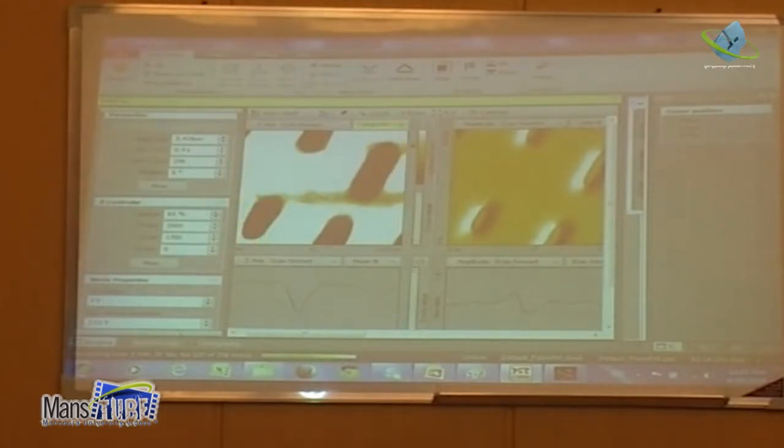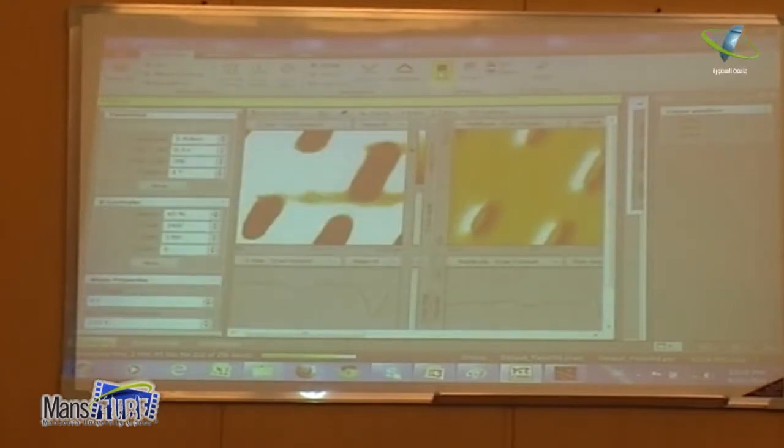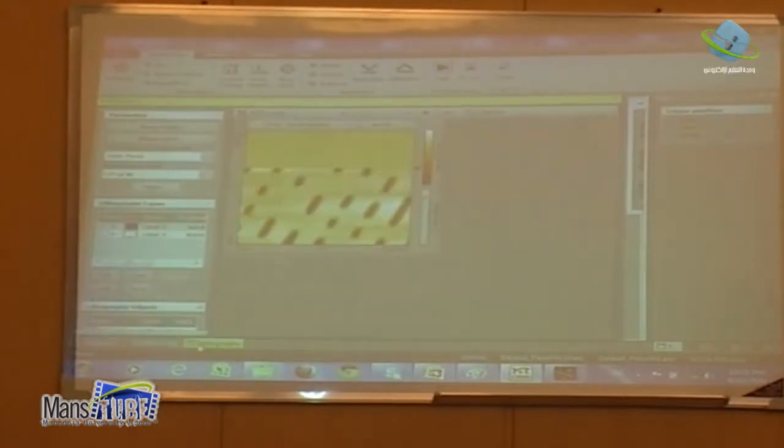You know what I have to do now? I need to stop. I need to make a load. Okay. I make stop. Let's see here. I make. No, I want to try. Start. Okay.